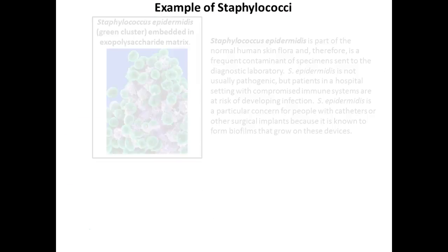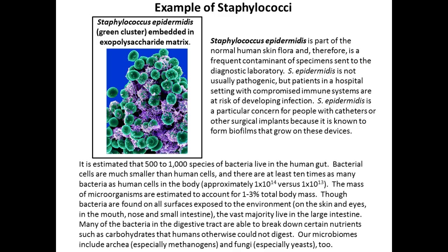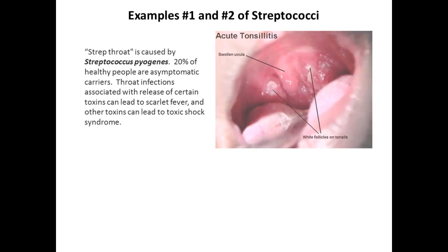They're not all bad, but then we jump back into the bad and somewhat bad. So Staphylococcus epidermidis is one of the ones we'll work with even today. It gets its name because it's commonly associated with our skin. This isn't the one that really causes the staph infections. It's Staphylococcus aureus that can be pathogenic. So there are some fun facts for you guys on that one.